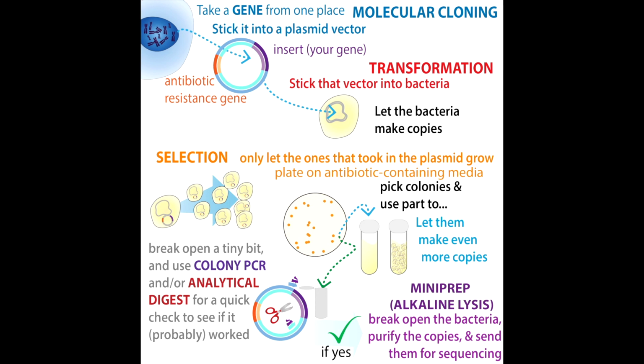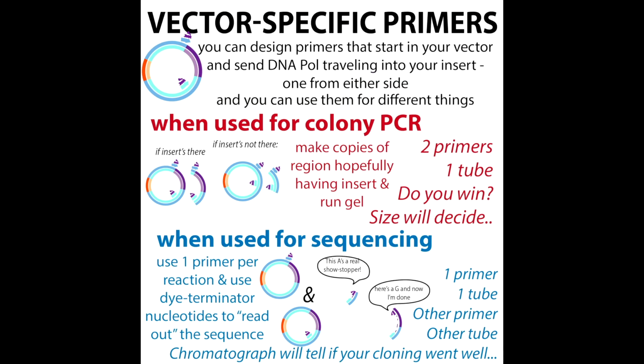But neither of those methods will tell you if all the spelling is right. For that, you usually send it for DNA sequencing, like Sanger sequencing. I'm going to ship it off to a place like GeneWiz, or I don't remember what company we used to use, because I know we switched. Some schools often have their own sequencing cores that'll do it for you. The idea there is that you use PCR primers at the start and end of your gene, so that you can make sure all of the spelling is correct. And I have a post on how to analyze that as well.